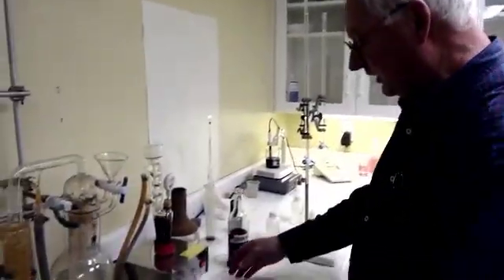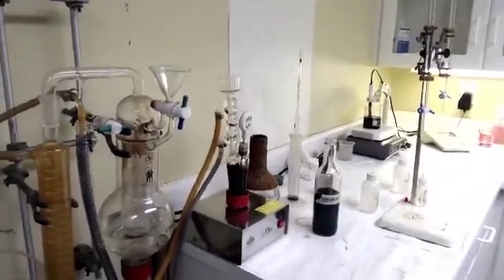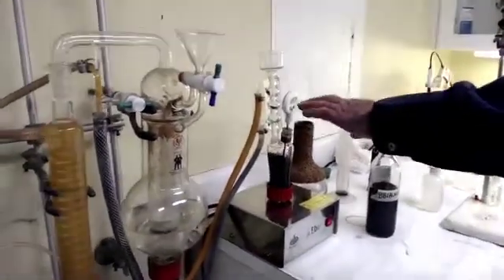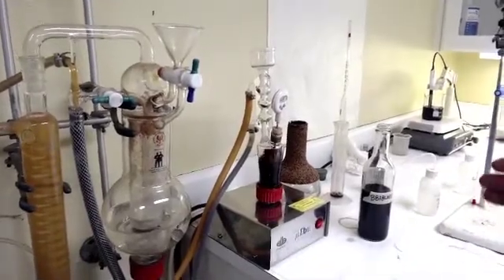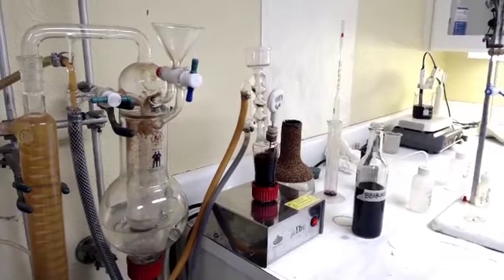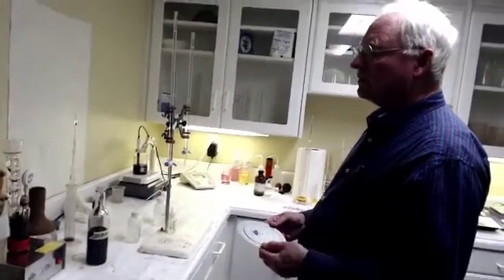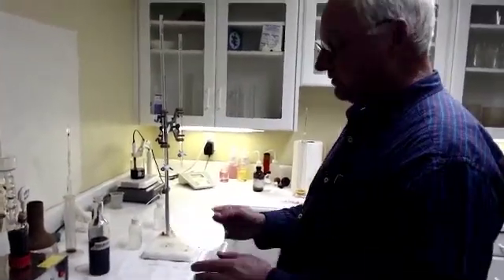Hi, we're back. As you can see, the ebulliometer — the wine sample — is boiling. We're watching the temperature gauge, and when it stops going up in temperature, then you know you're at the boiling point. It's boiling at 88.9 degrees Celsius.